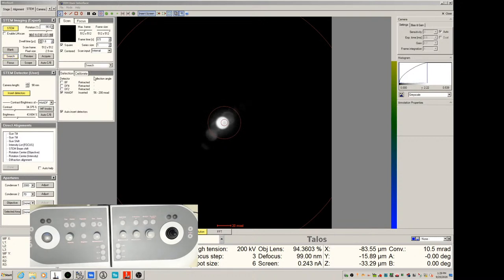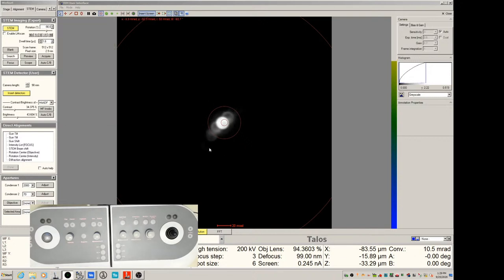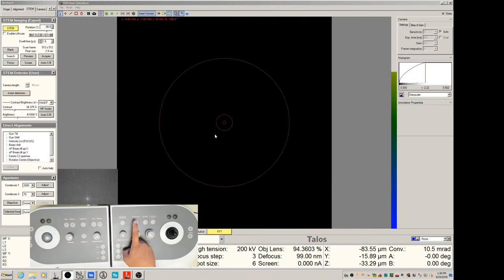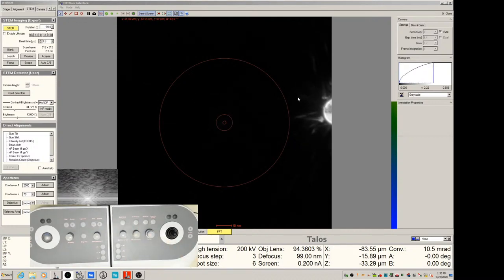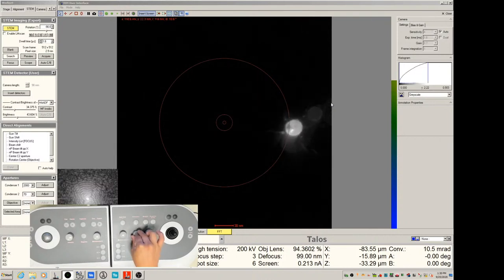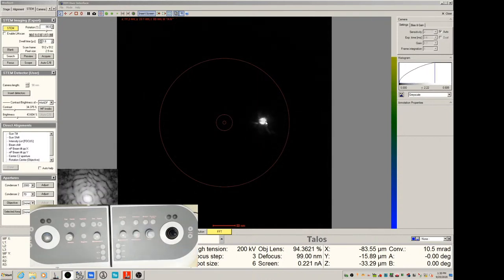Now we are at 3.4.3 in the SOP, probe alignment. We will first stop the search in this tab. So the search is stopped, and now we are seeing the beam on the flu cam. Let's press the diffraction button on the right hand panel. All right, now we should be able to see the beam showing up on our flu cam. If you don't see it, turn on zoom out.